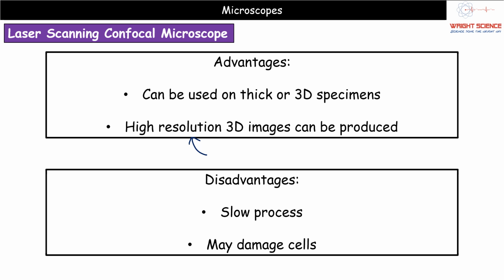There are, of course, a couple of disadvantages to be aware of. Firstly, this whole thing is a slow process. So in order to get that image, it's going to take quite some time. And in the process of doing so, we can damage the cells themselves.